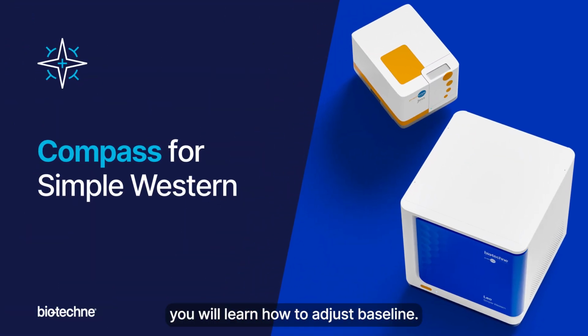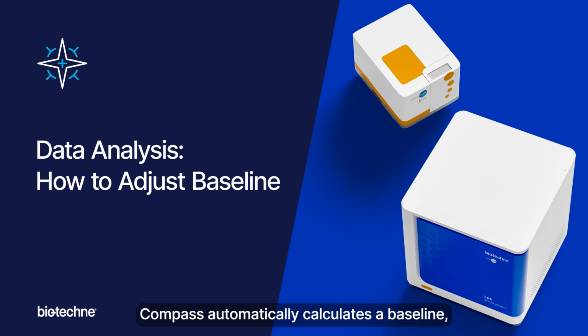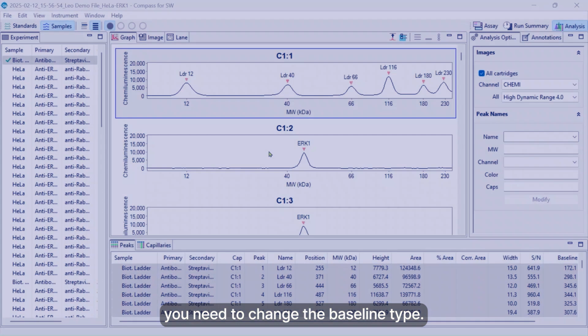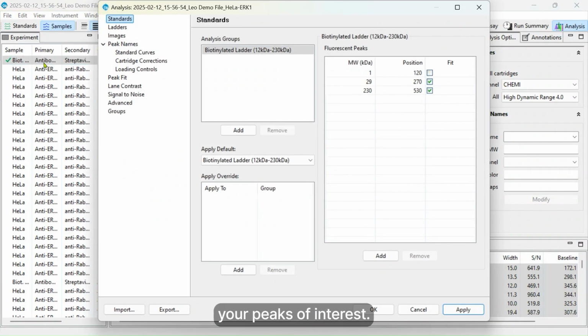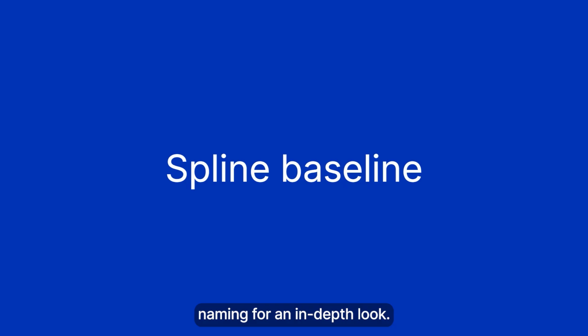In this video, you will learn how to adjust baseline. Compass automatically calculates a baseline, but you can modify this. To do this, you need to change the baseline type. Before we start adjusting baseline, make sure that you've named your peaks of interest. Check out the video on peak naming for an in-depth look.